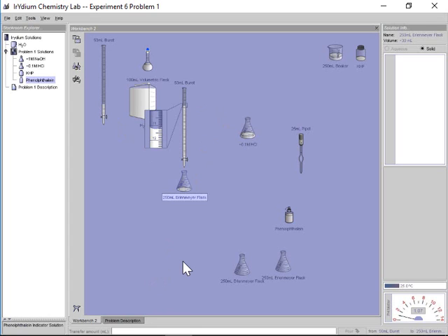I'm going to transfer in. Again, I could do 1 mil. I can press enter 20 times. I can go like 1, 2, 3, 4. I can do that. Or because I know it's not going to be within 20, I did 5 mils there. I can type in 15 mils. So that should be safe. Fine. I've typed in a total of 20.